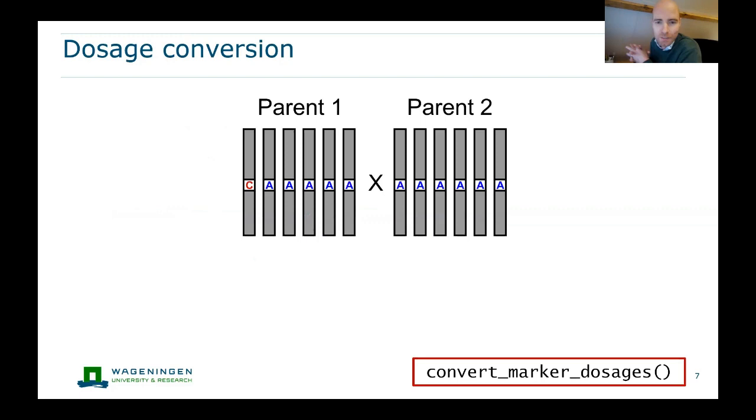In terms of what these various steps look like, our rationale behind converting markers to their simplest form is that it's essentially a little bit arbitrary what you call your reference or alternative alleles. And there are, for our purposes, computational advantages to simplifying them where it's possible. What we also like about converted marker scores, at least in the mapping process, is that they give a more meaningful representation of the distribution of important alleles in your material.